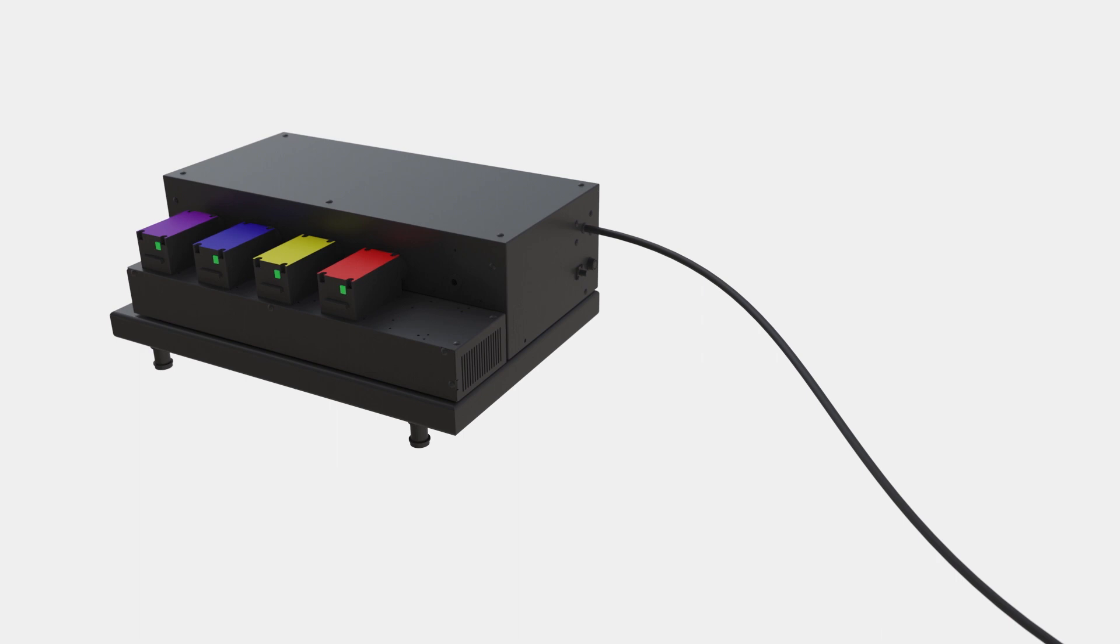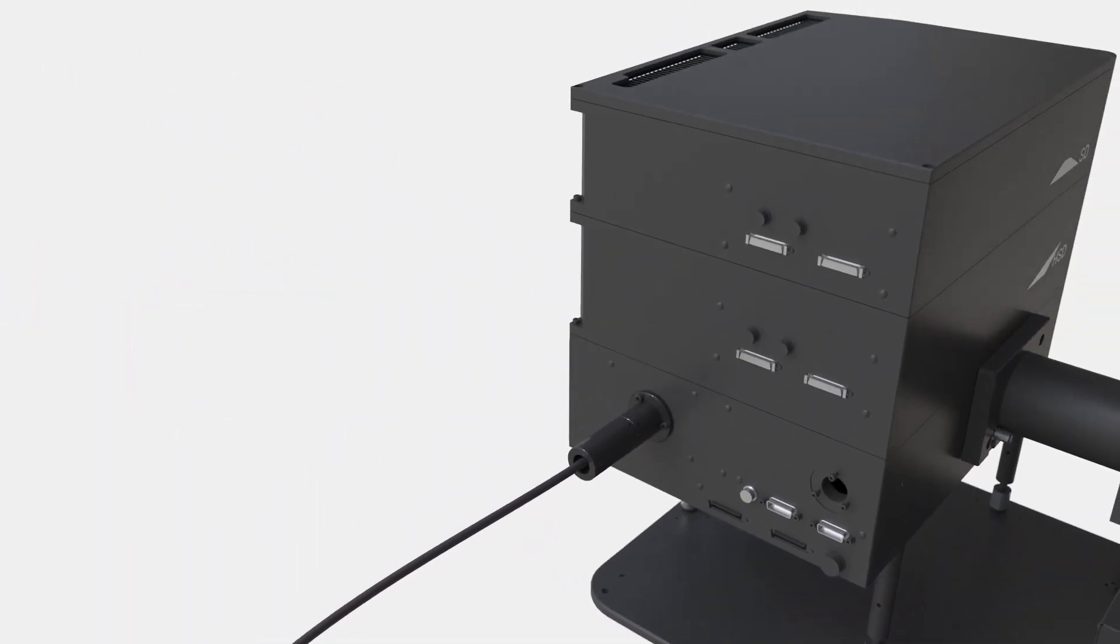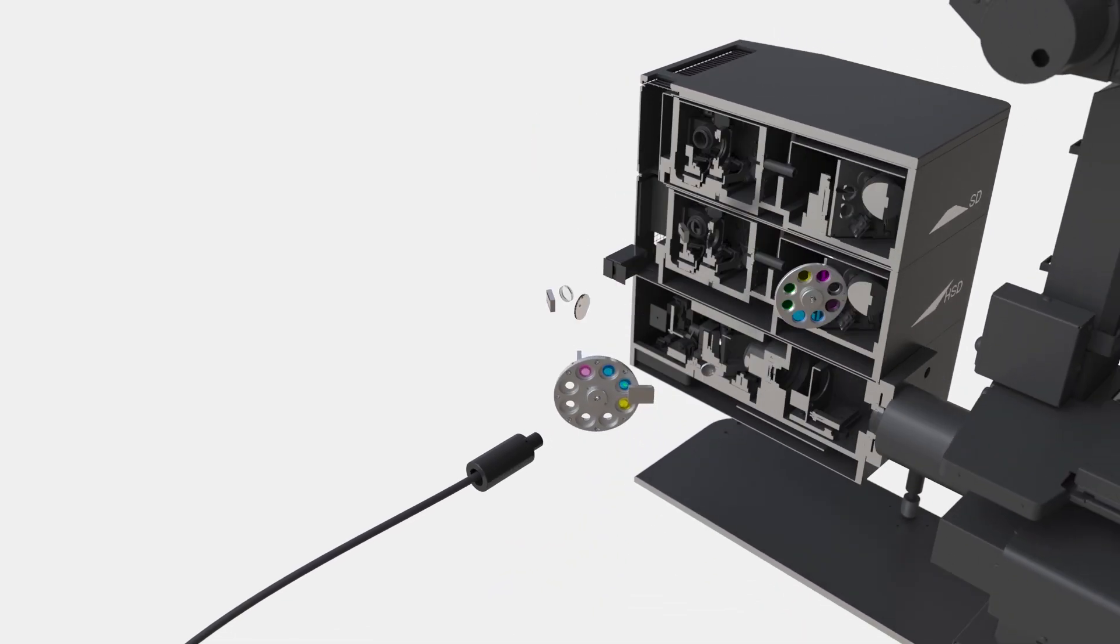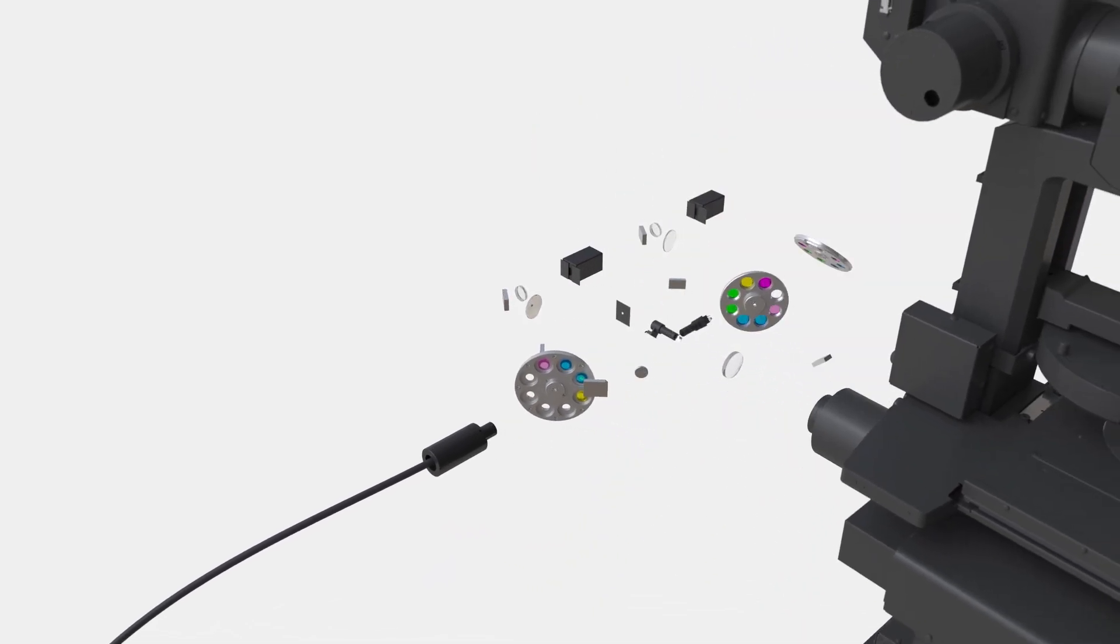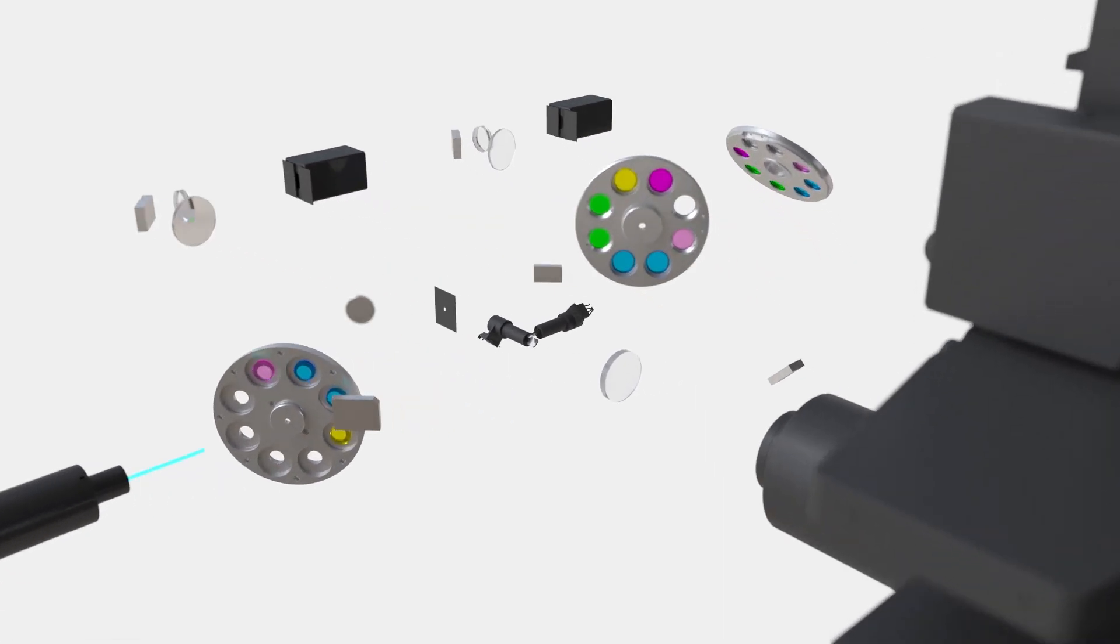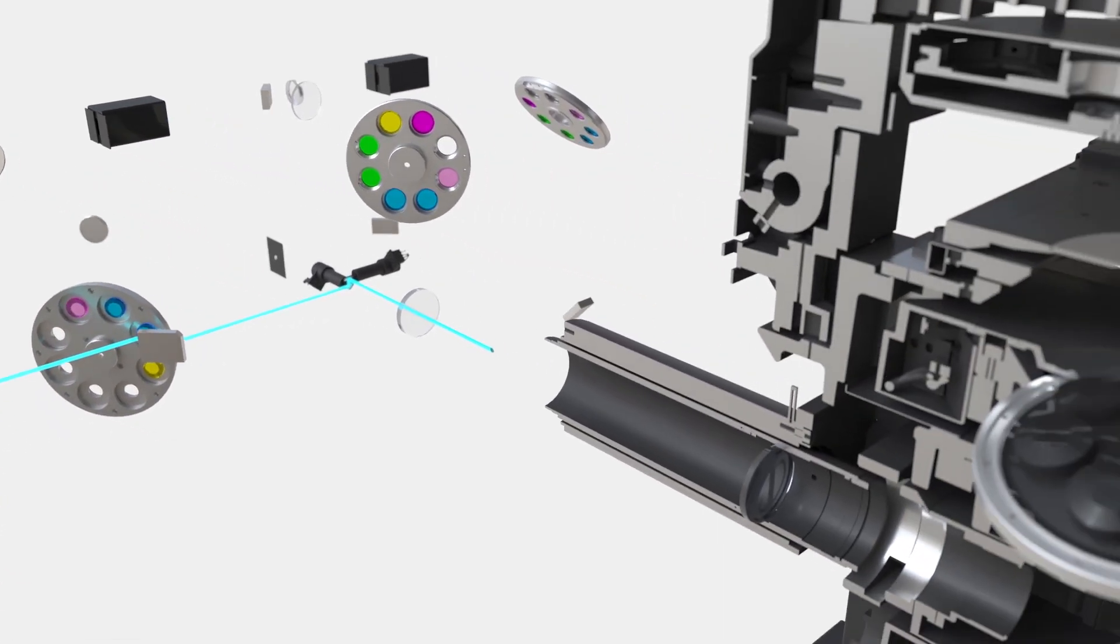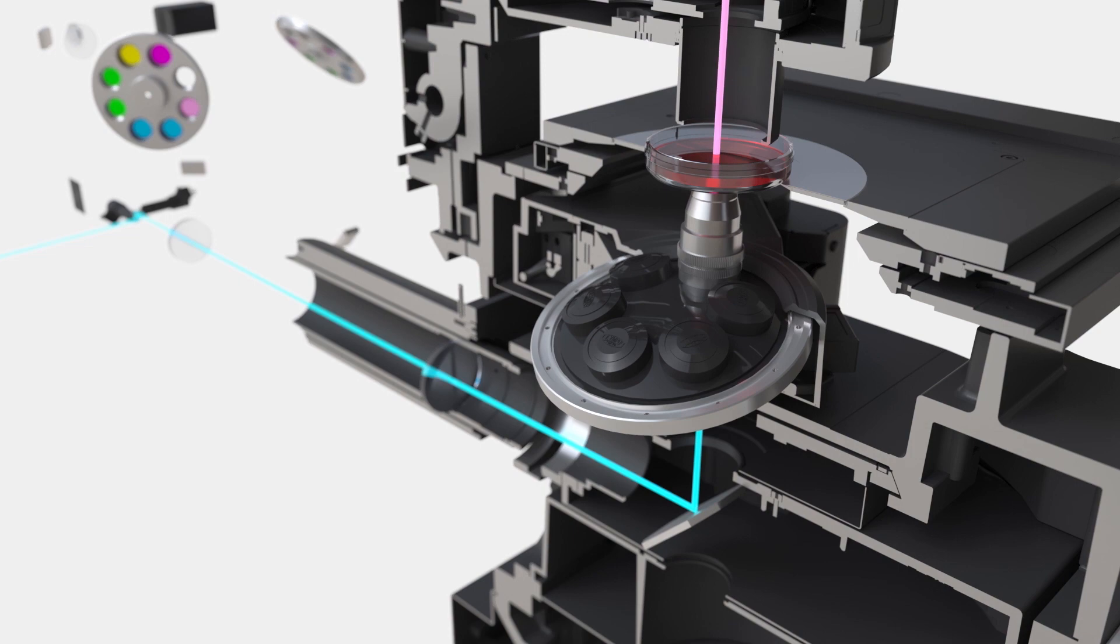The FV3000 microscope has an all-diode suite of lasers featuring up to seven individual laser lines from 405 to 640 nanometers. Inside the scanner, the excitation laser beam is guided to the sample by the excitation dichroic and silver-coated scanning mirrors.